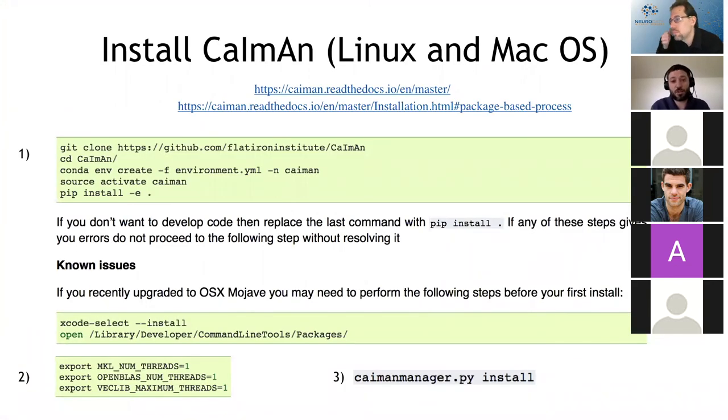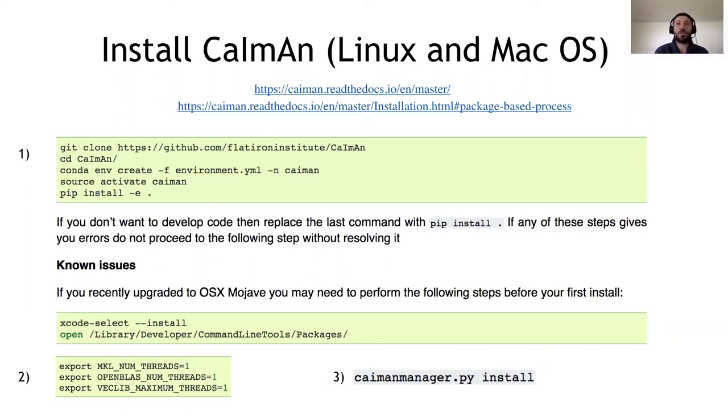CaImAn is a package for the analysis of calcium imaging data. Today we're going to focus mostly on multi-photon imaging data analysis. And if you guys want, you can start installing CaImAn. If you want to install it in Linux and macOS, it's relatively straightforward. If you want to do it on Windows, it's a little bit of a masochistic experience, but you can still do it.